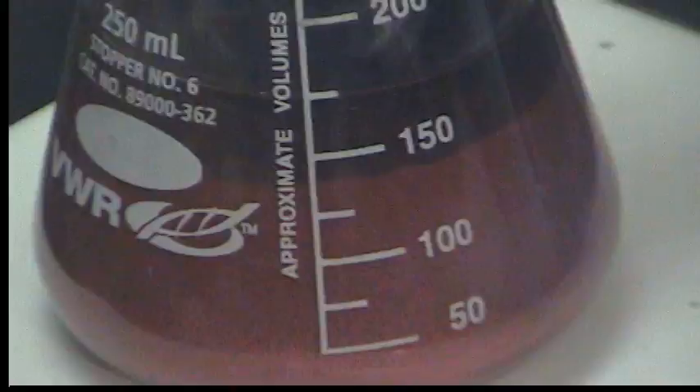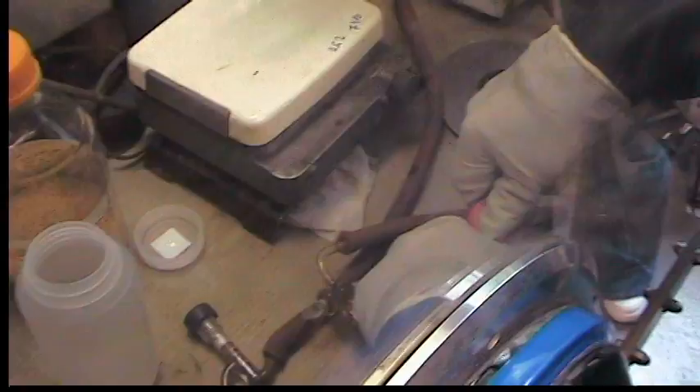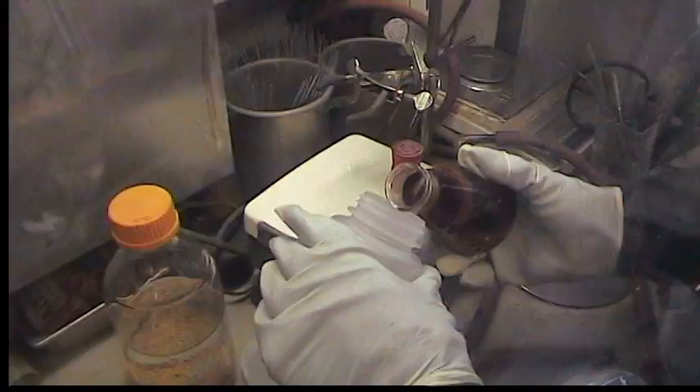Grab the THF. Okay, so now it's settled. The stopper has expanded nicely overnight. I'm just going to decant off the ether the best we can.